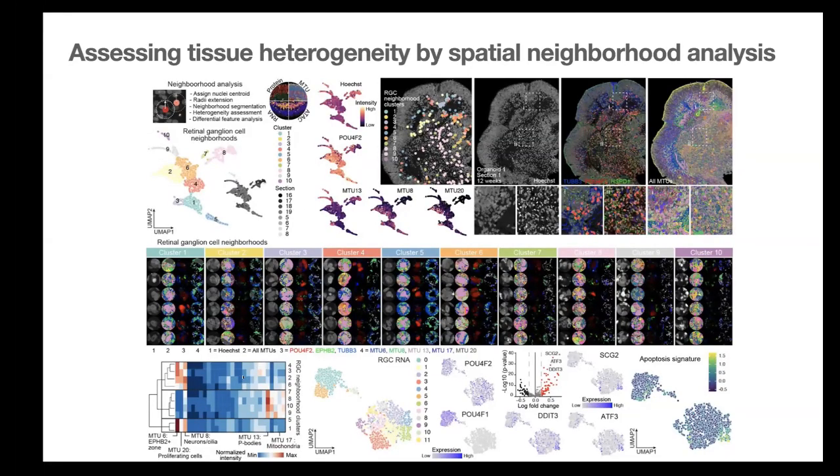And we've seen that there is actually a heterogeneity for these RGC cells in the organoids, and actually there are MTUs which are related to apoptosis, so high mitochondrial content, wrinkled DAPI stains, stuff like this. We could observe, and then we could go back to the single cell data and do classical DE gene analysis for these two clusters here, and then we've seen that in the major populations of the RGCs, an apoptotic signature was enriched. So I mean, we couldn't solve the riddle why these are dying off, but we can definitely say by week 12 they die.